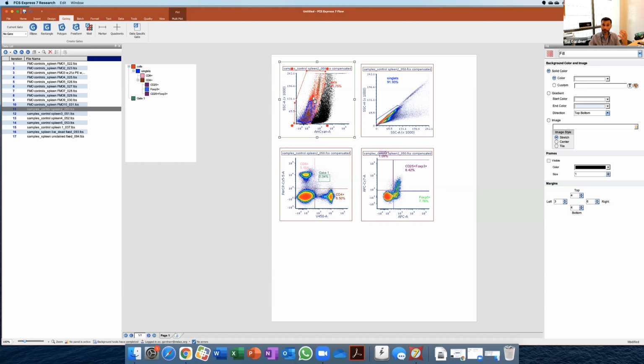If it's not very obvious in the scatter, maybe at least, if you're interested in FOXP3, CD25, etc., T-regs, then you want to express this as percentages of CD4 cells, because as you saw, CD4 cells are easy to identify, regardless of whether we're moving things here or not. Of course, if you include the dead cells, you're going to be skewed, but you're pretty safe in moving this gate, and the percentages are not varying that much. So this is a robust measurement, the CD4 positives, because they pull out pretty nicely.